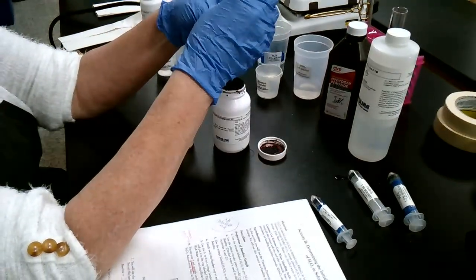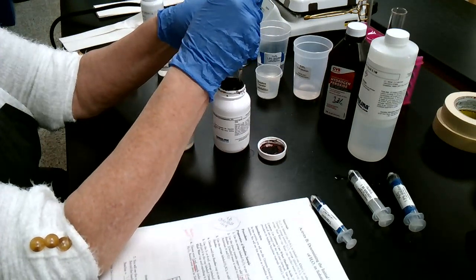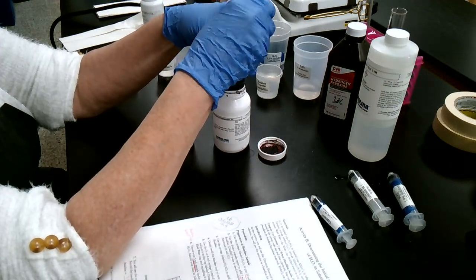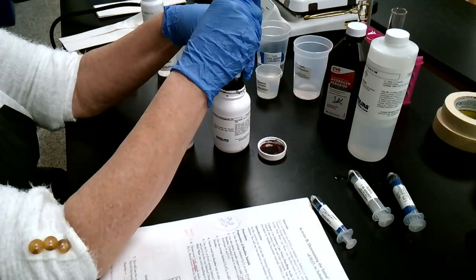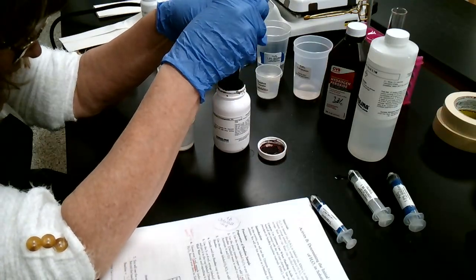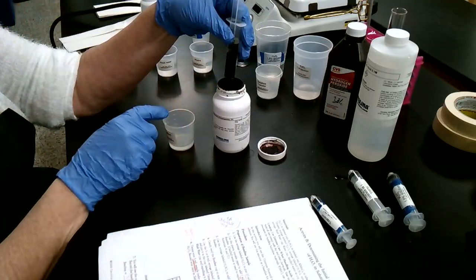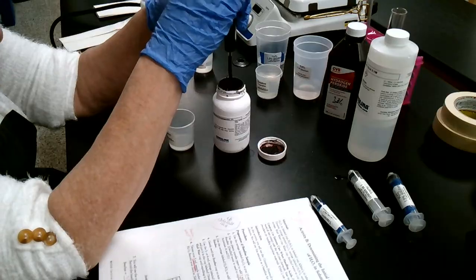Now, what I suggest you do is pull up the syringe a little bit at first and then start sucking up the potassium permanganate. I always say get more than 5 milliliters, because you have 5 milliliters total in there, so the most it's going to take is 5 milliliters.